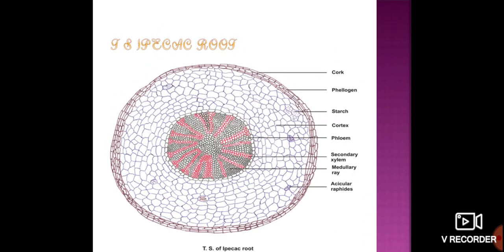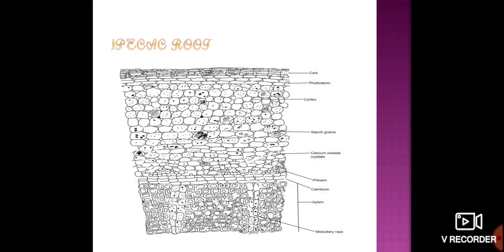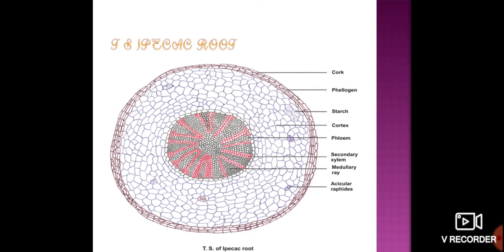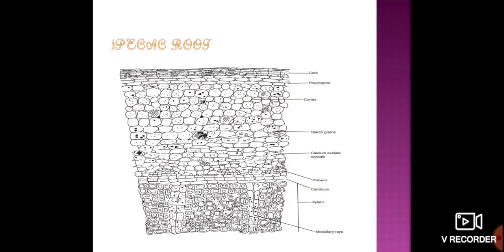This image displays the transverse section of ipecacuanha root. The first outermost layer is the cork, which is circularly present. Inside the cork are 3 to 4 cell layers of phellogen. Below the phellogen is the cortex region.